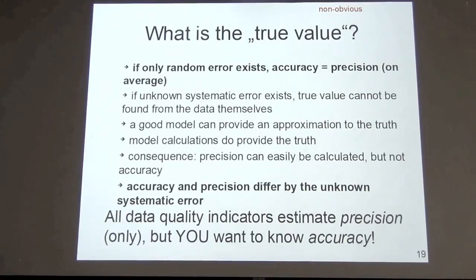Yeah? So this is the big difficulty that people have. They look at the indicators and they want the indicators to be beautiful. Let's say Table 1 gives us beautiful R merge or whatever, or I over sigma, and they mistake it for talking about accuracy. But this is not the case.